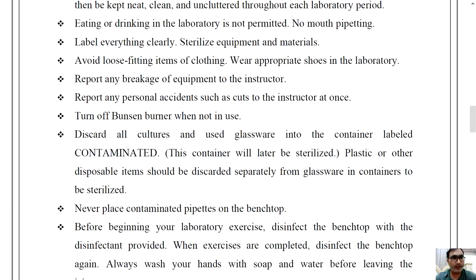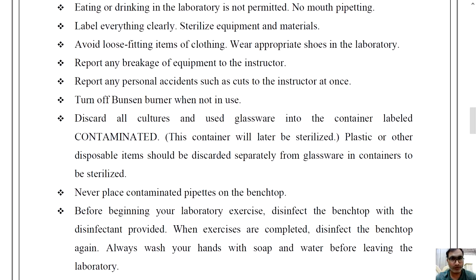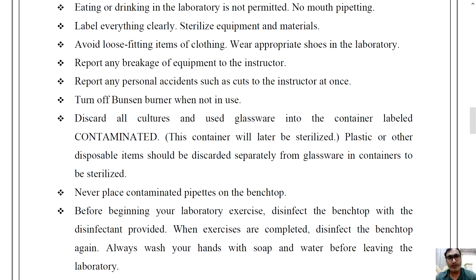Report any breakage of equipment to the instructor. If you break any instrument or glassware, you must inform your instructor, because it may be more dangerous if you do not inform them. They can then take care of it properly.